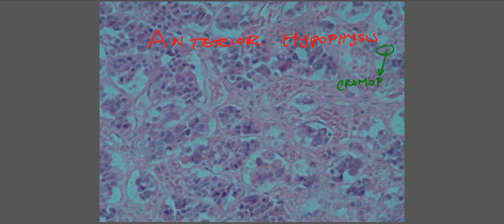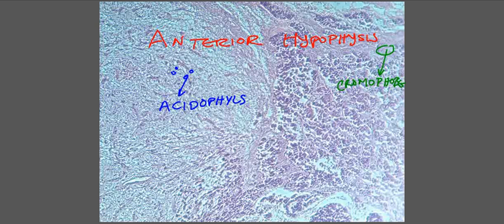Obviously, this is information that it's going to be really hard for you guys to be tested on. Like, I can't really put a microscope with a slide and ask you what specific cell that is. What you need to know is what cells you will find in that particular part of the hypophysis, right? And most of those that you see here, those kind of darker in stain, well, it could be either acidophils or basophils, but I think, and the researchers think, it's more acidophils, right? Now, when I show you these, it's because you have the two lobes, right?